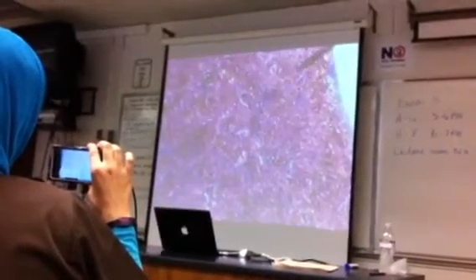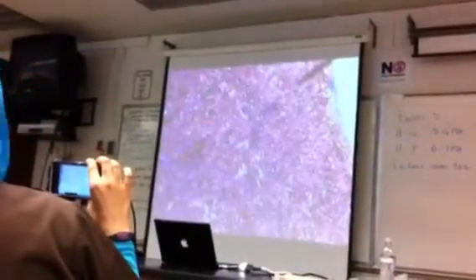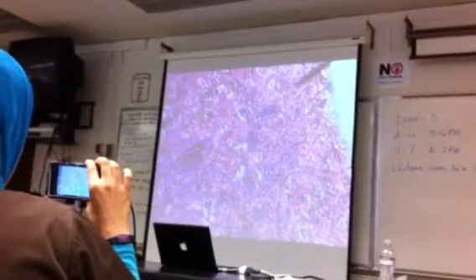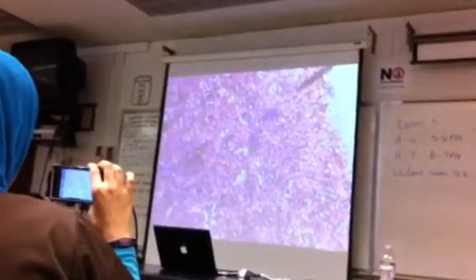But I swear, let me go back here. I swear I've seen a slide which looks a little better than that. Let me see if I can find another slide that's 31. 31 is the number. No, they all look the same. Oh, these are new slides. Well, that explains it.